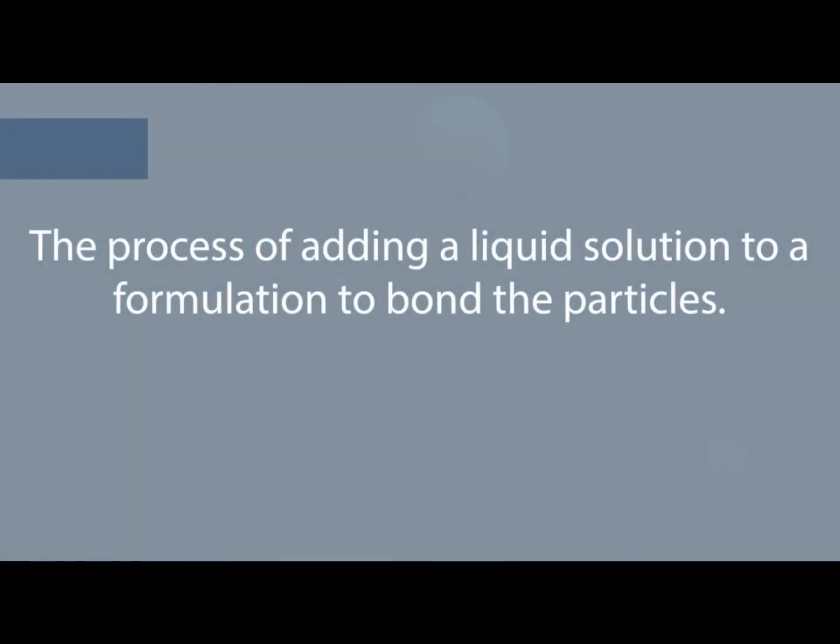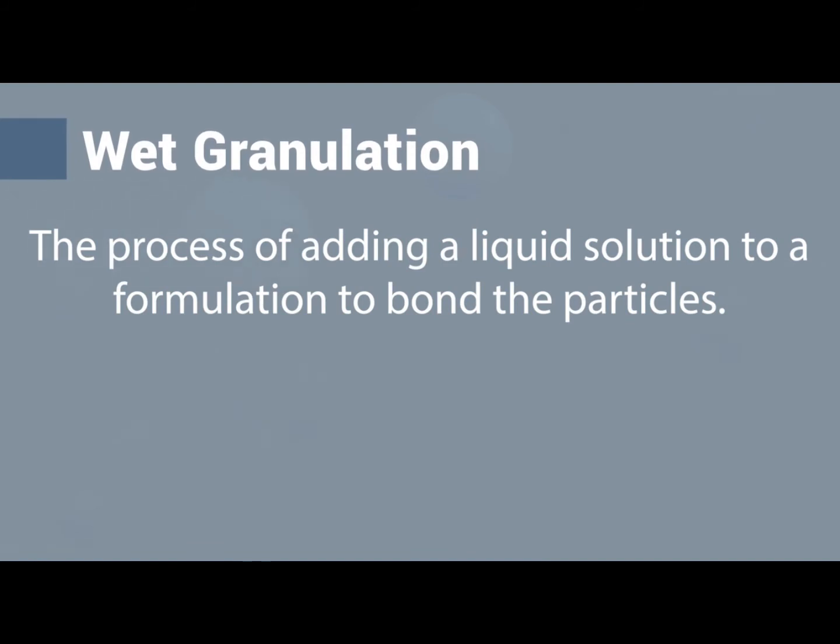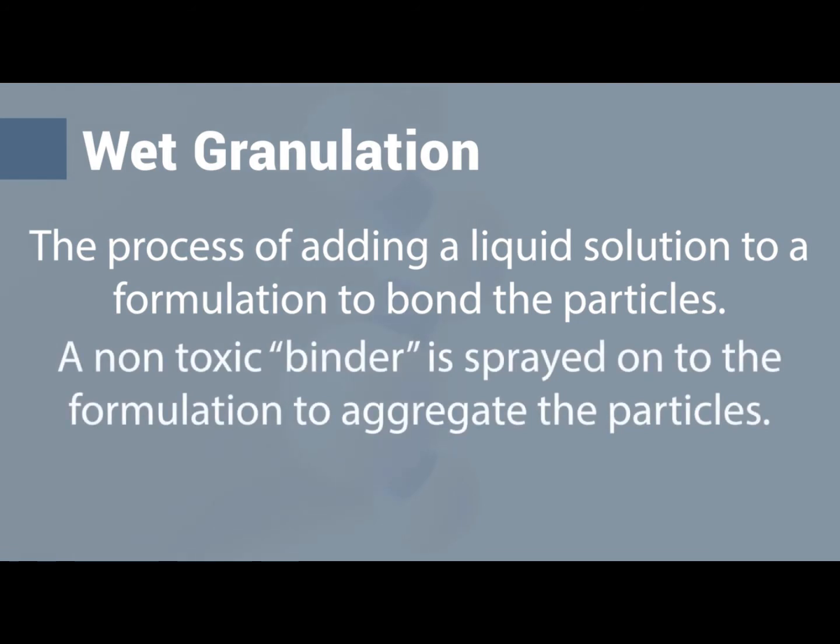Whilst being one of the most complex forms of granulation, wet granulation is one of the most popular due to it being applicable to most formulations with the purpose to cause aggregation of particles. The adhesive, usually called a binder, is incorporated in the form of a solution or suspension in the suitable liquid. The liquid should be non-toxic and is preferably water, although other solvents are sometimes used.